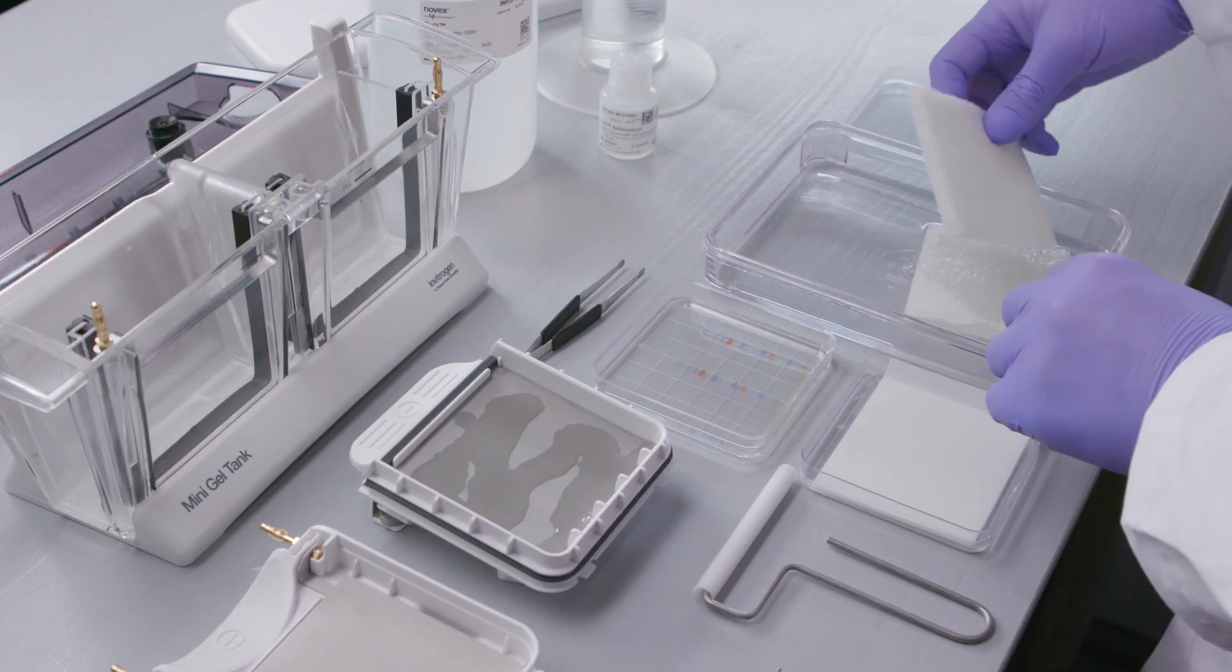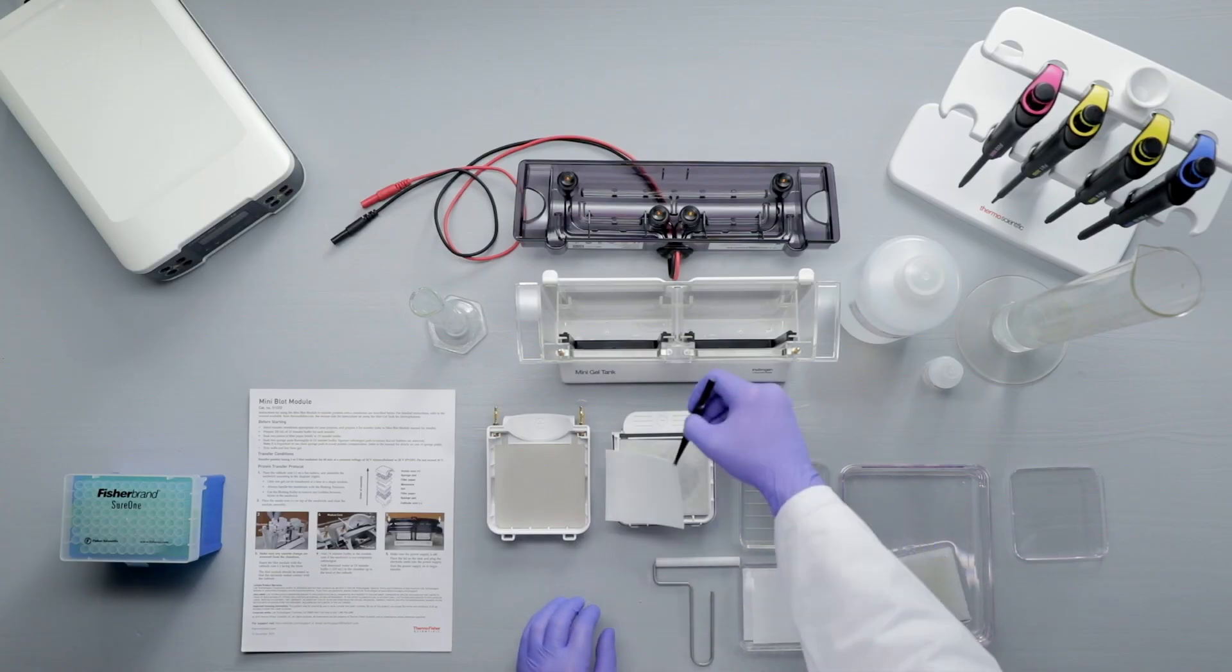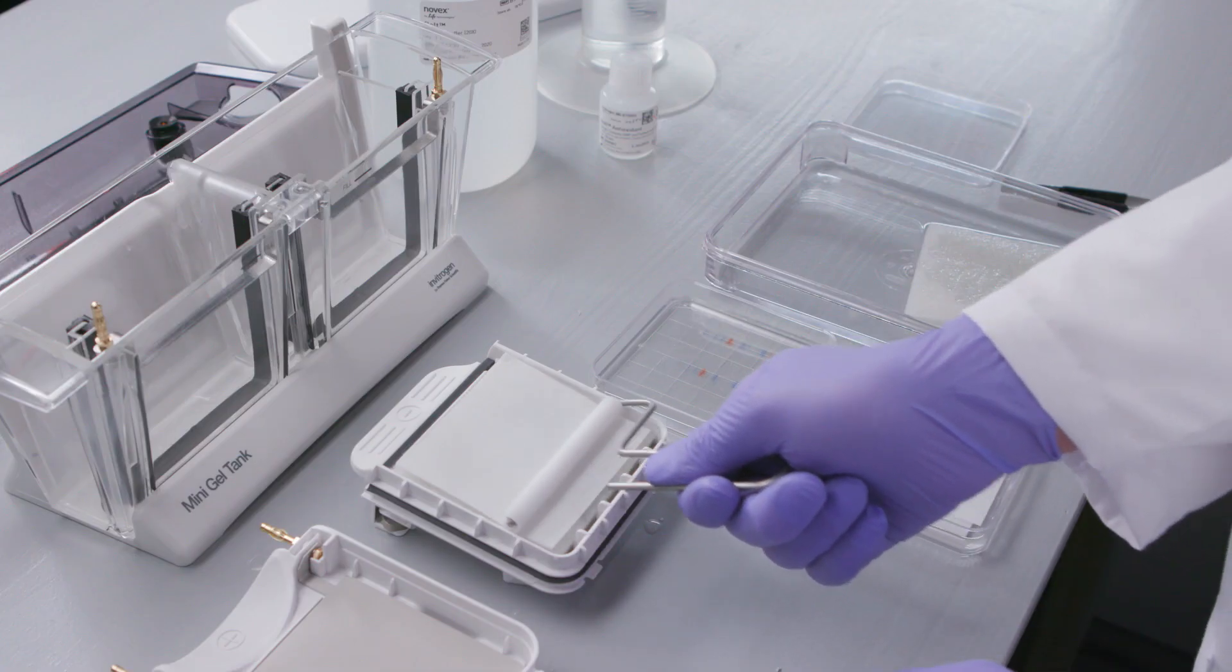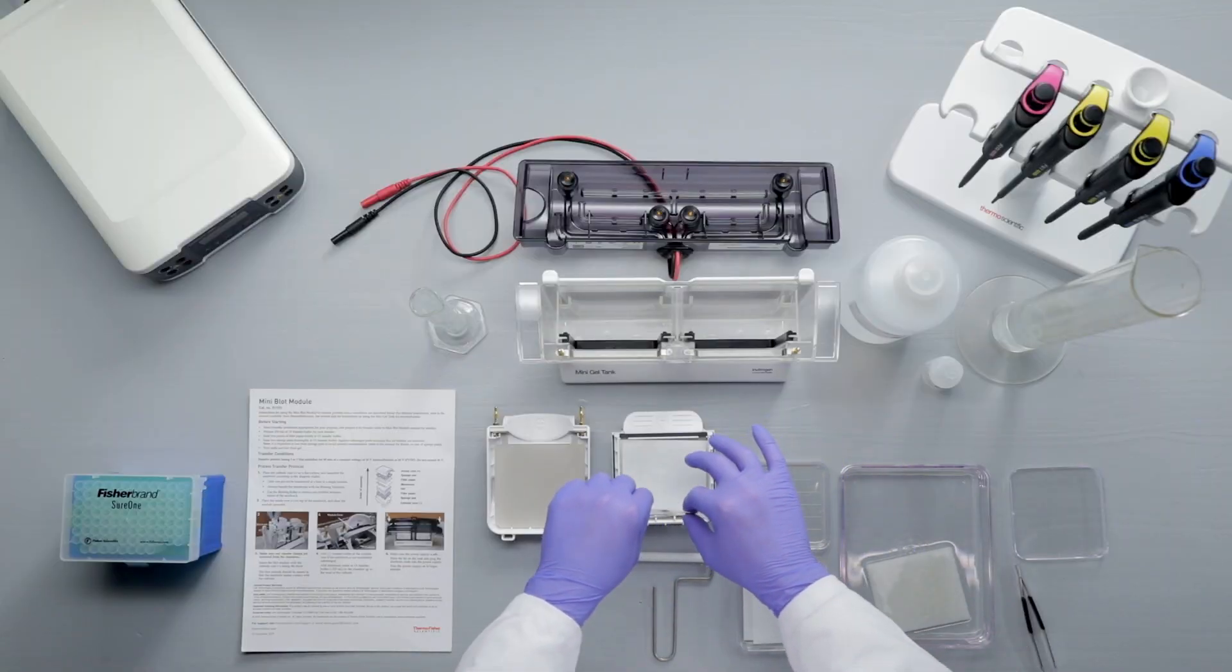Then place a pre-soaked sponge pad on the cathode core, followed by a pre-wetted filter paper. Next, use the blot roller to squeeze out air bubbles from between each layer. Place the gel on the stack, again using the roller to remove air bubbles.